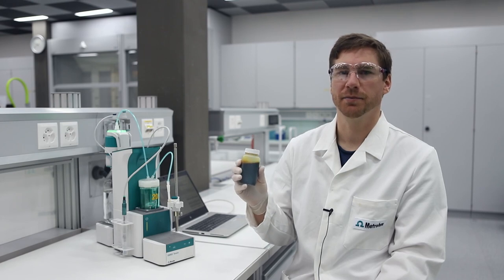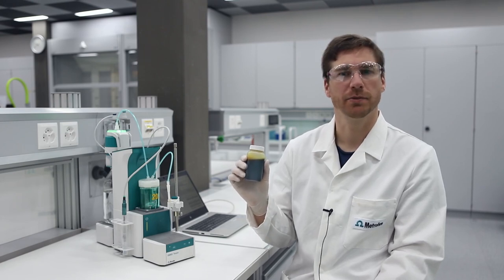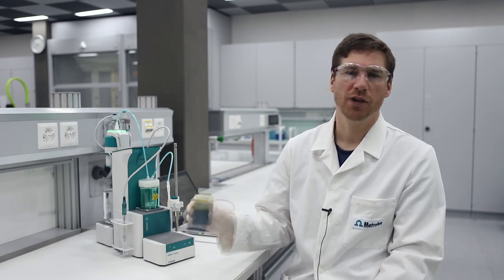Do you analyze the acid number of petroleum products by potentiometric titration? Do you have issues with the reproducibility of your results?